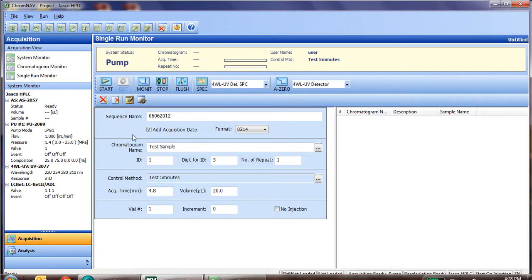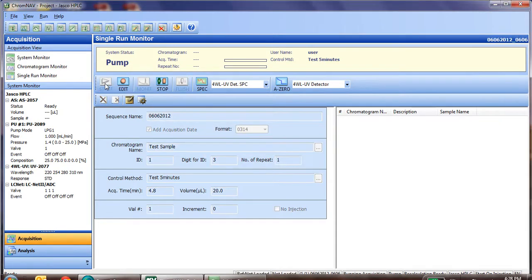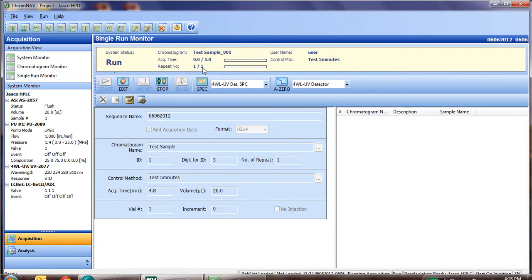Now that we've entered this information in, we simply click the run button. You'll notice now the system status says run. It has filled in all of the sequence information. And on the left side, the auto sampler started to flush, meaning it's washing the needle before it picks up the sample.